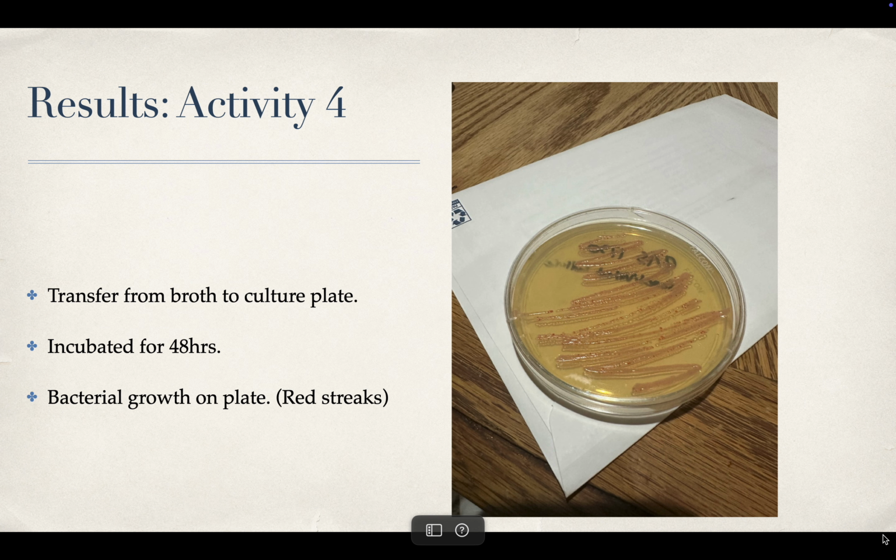These are my results from activity number 4, transfer from broth to culture plate. It was also incubated for 48 hours. Bacterial growth was observed on the plate as the image on the right shows streaks of red microbes growing.